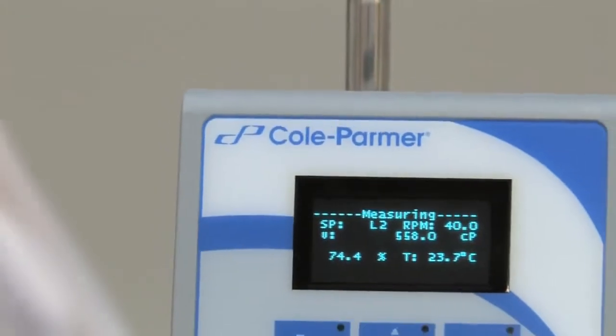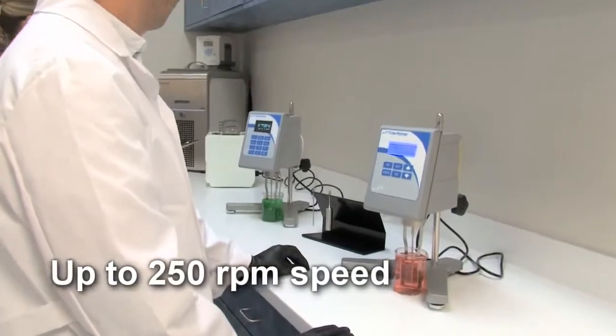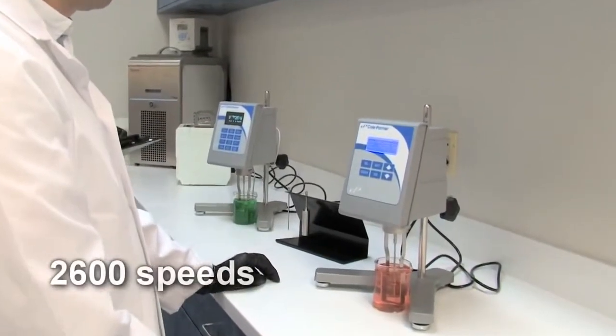The programmable viscometer with temperature probe delivers the highest speed range, up to 250 rpm and 2600 speed selections.